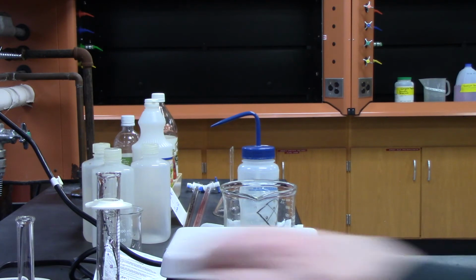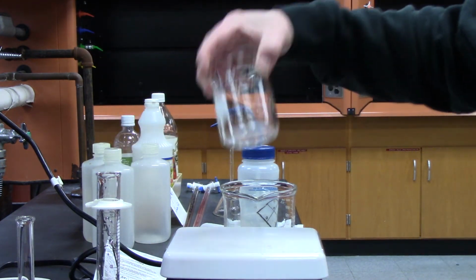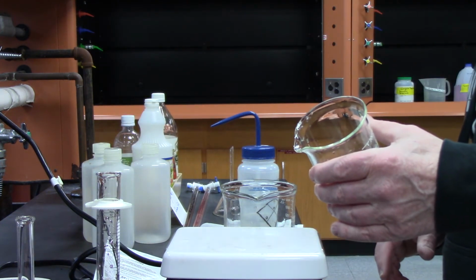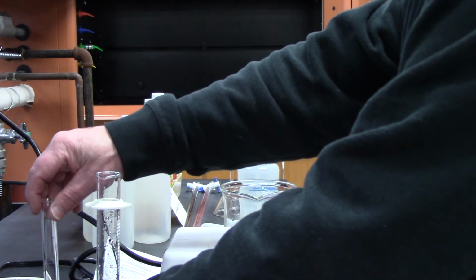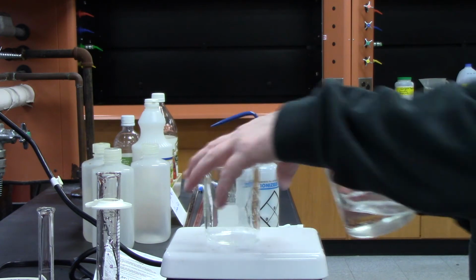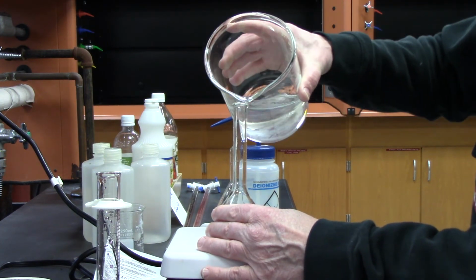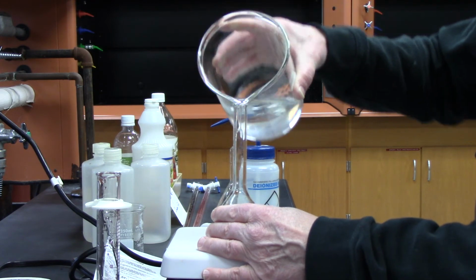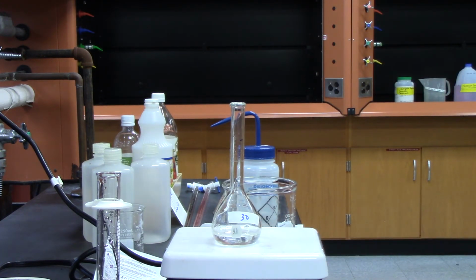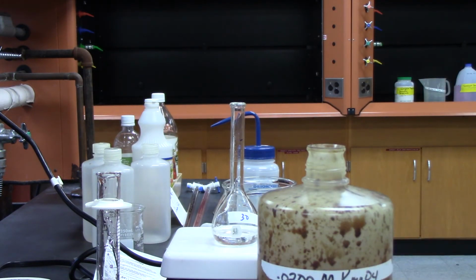All right, now I'm going to use my stock to make up my last solution. It says 15 mils, and this time I'll make it up in my beaker. Okay, so I'm going to add not very much. Actually, I'm going to make it in a volumetric flask. So I'm just going to add a little bit of water to it. Hopefully that's not too much. And I want to add 15 mils of my stock. I'm going to use the pipette.